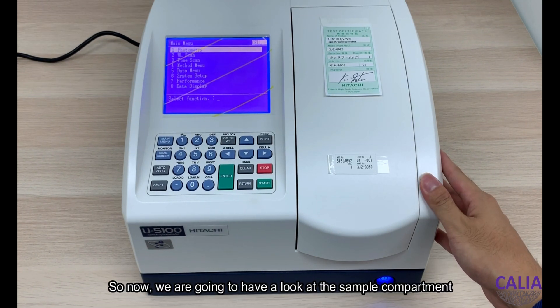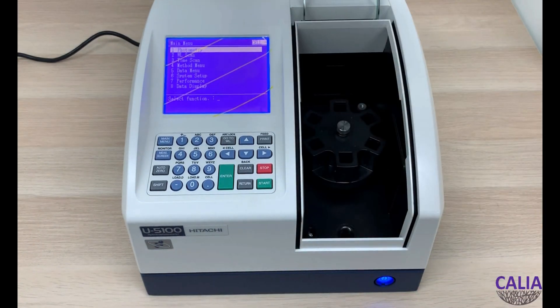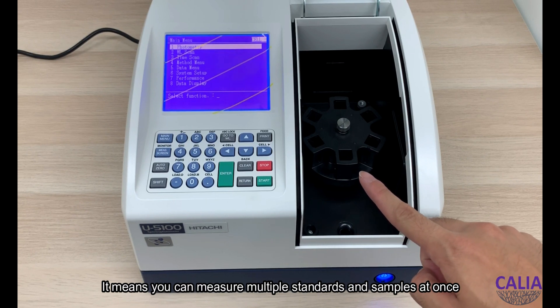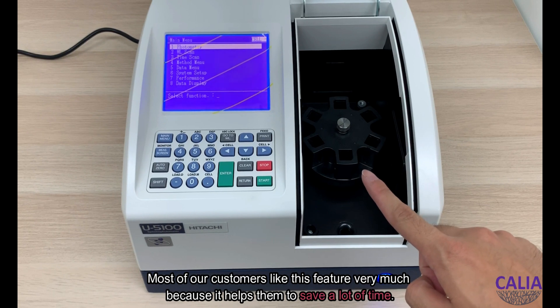Now we are going to have a look at the sample compartment. This instrument comes with an automatic 6-cell turret as the standard accessory, meaning you can measure multiple standards and samples at once. Most of our customers like this feature very much because it helps them save a lot of time.